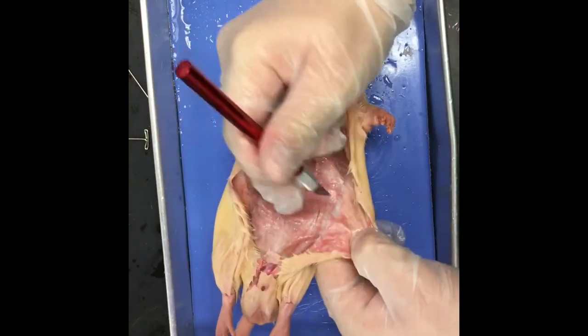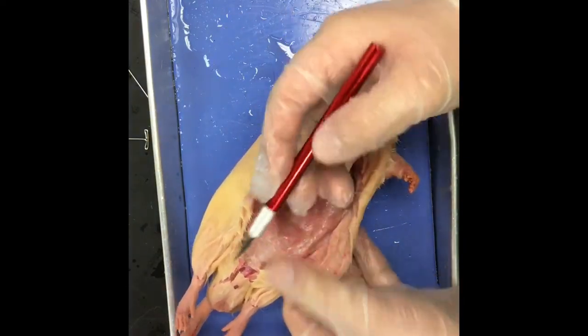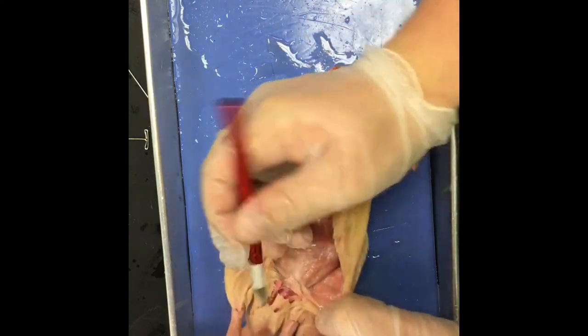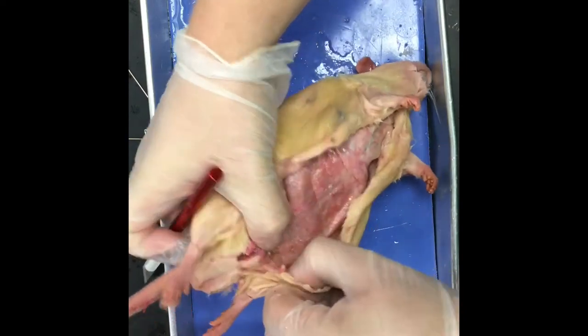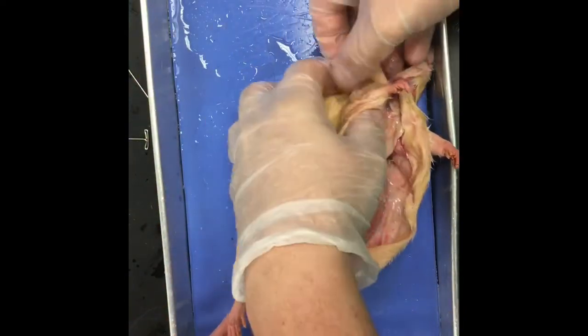All right. So. You can also take the back of it and rake against it. That way, if you're worried you're gonna cut an area, you can still cut an area with this on accident, but it's a lot harder. Go through. And then what you're literally gonna do is you're gonna skin that boy.